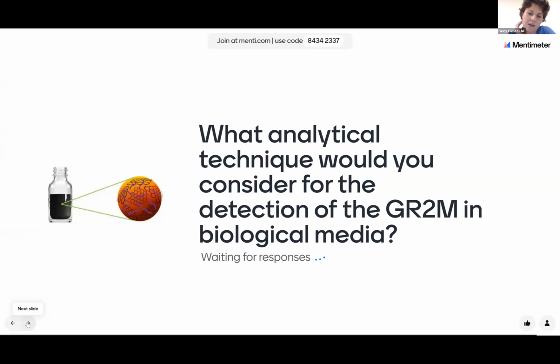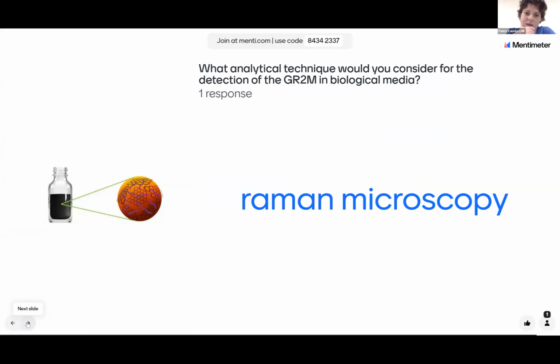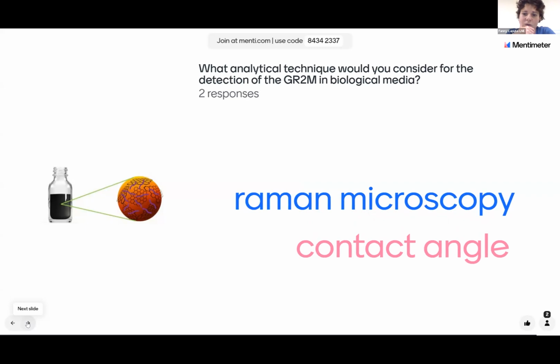So I'm thinking this is an open question. It's with regards to the fact that techniques that may be considered, for example, in guidelines generally, like UV-Vis, may not be suitable in all kinds of media. There are some cases with fluorescent techniques where there are interferences that have to be considered.